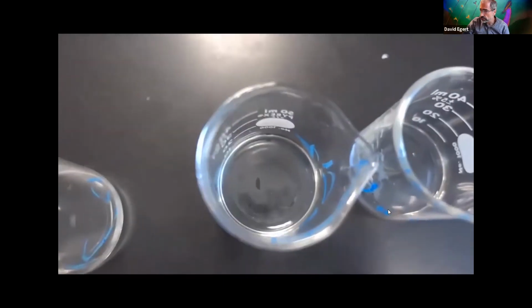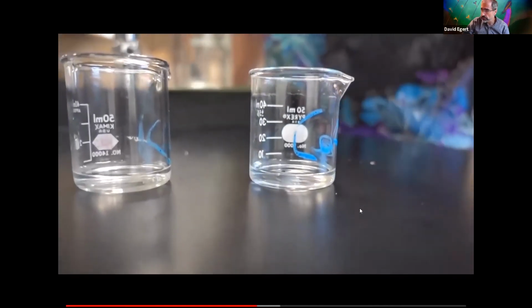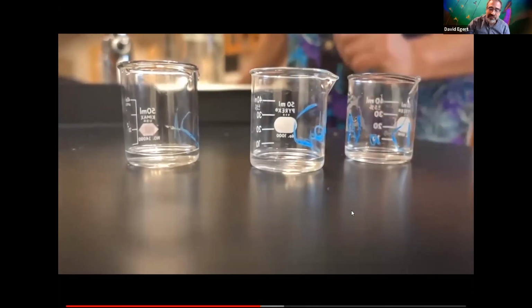And here we're trying to decide, record the appearance. Like, can you see it still? Did it dissolve? Did it disappear? I have to say, looking at these, they all pretty much look like they've dissolved. I don't really see the granules in there anymore. Sometimes it looks from the top like there's some white, but there's also white crap on the table underneath. So you have to trust me there that they were dissolved.